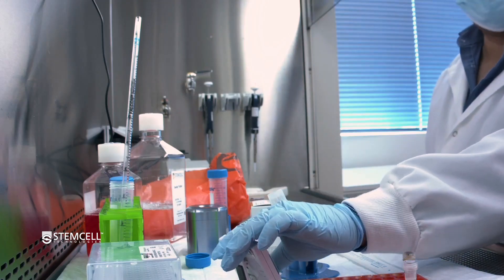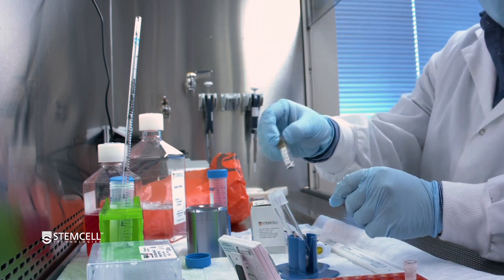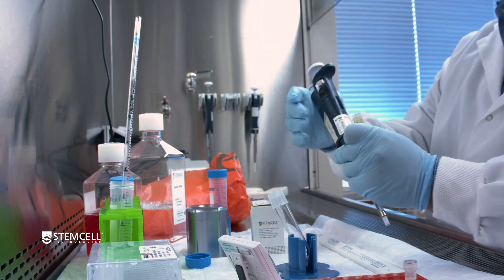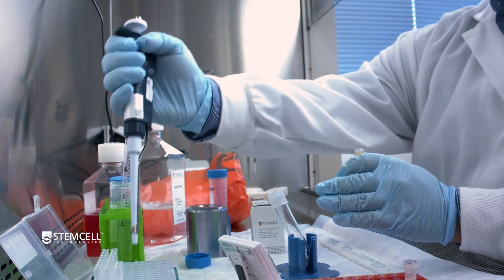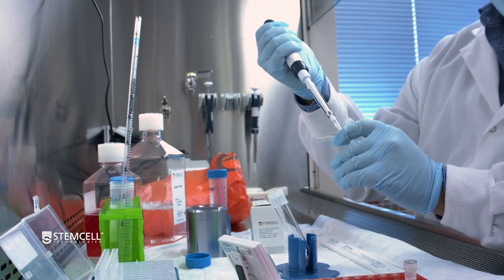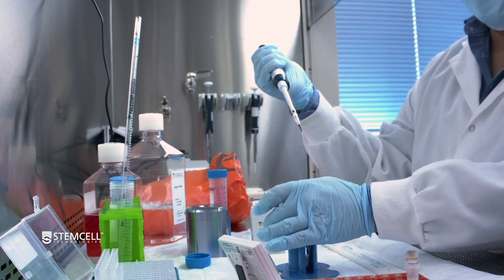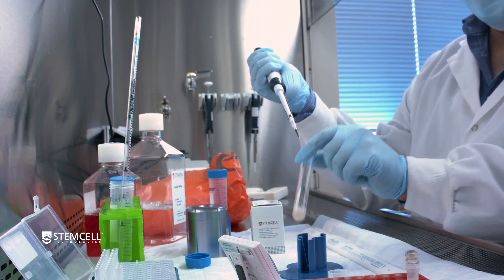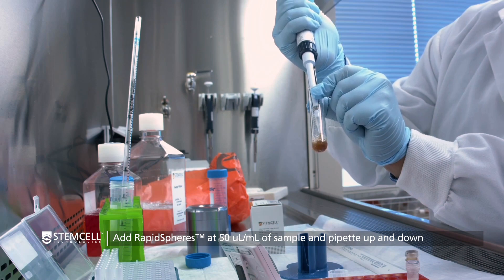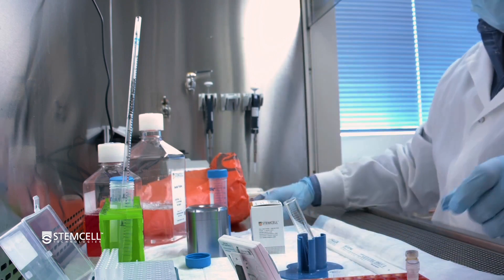Once the five-minute cocktail incubation has elapsed, you're going to want to add the vortexed dextran rapid spheres to the sample. When doing this addition, ensure that the end of the tip goes into the sample liquid volume. Here we're just going to take out 50 microliters into our 1 ml of cells. Do a quick little mix, getting all that reagent into the sample.